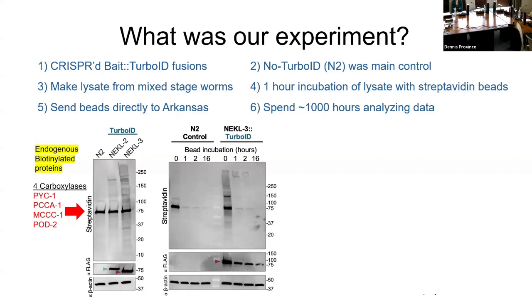And it really just comes down to 4 proteins, some of which co-migrate, that are biotinylated. They have multiple isoforms, so on some of our gels we often just see one predominant band. On others, we see more distinct bands. So what you would hope to see, because you've now added a new biotin ligase to the cell, is that in addition to this one, there should be other bands. And we do see some other bands here. So that's a little bit promising, right?